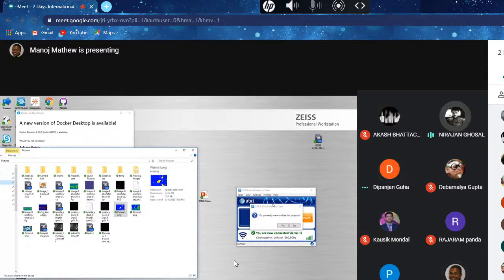Hello, this is Nirajan here. Can we do this kind of experiment or use this kind of module on Z-stack images? Yes. Each module is designed for a certain image dimension. The modules that I showed you work on 2D data. But let me go back up here.